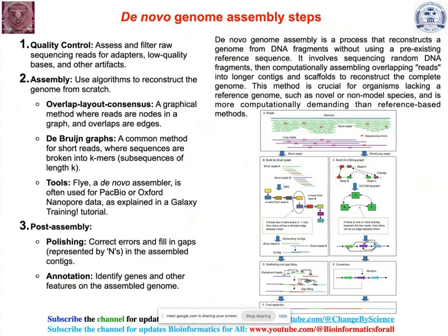This method is crucial for organisms which lack a reference genome, such as novel or non-model species, and is more computationally demanding than reference-based methods.